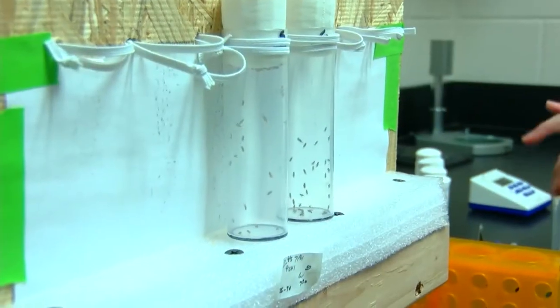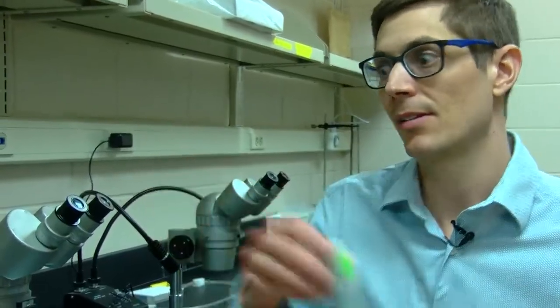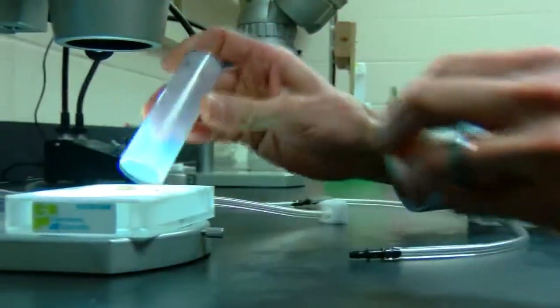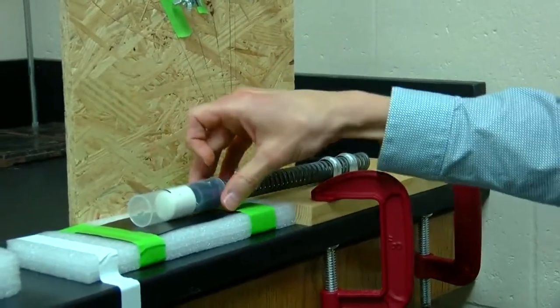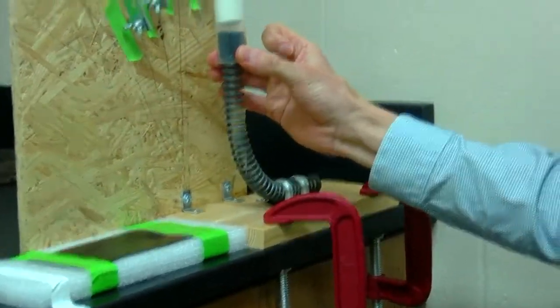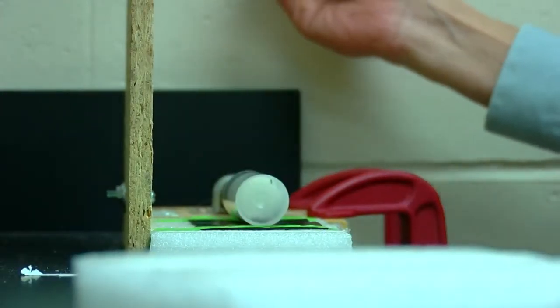So how exactly does he put these flies to the test? We sort them into vials much like this, using the aid of a microscope. We put the vial at the end of the spring. We have these several different stopping points. And so if we deflect this vial all the way back to this last stopping point, that's going to be our 90-degree deflection angle. And so that's going to cause the most severe injuries.